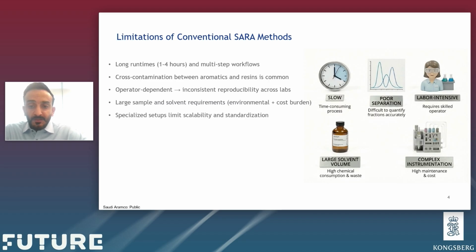And most importantly, these methods are heavily operator dependent and results vary from lab to lab, making it really hard to use the SARA data confidently in models or for operational decisions. Because many steps rely on custom columns or complex configuration, standardization has also been difficult.